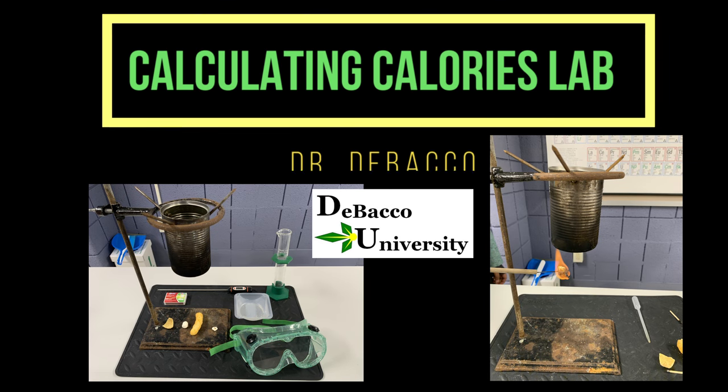Here on this DeBacco University video, the procedures for the counting calories lab will be covered.